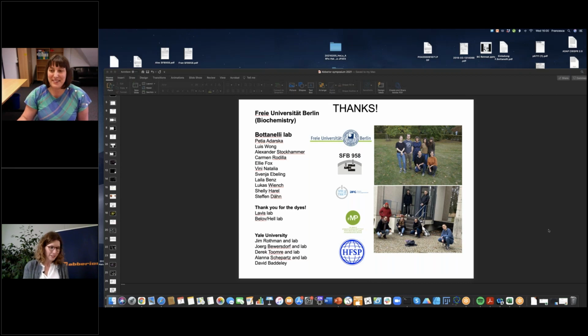Thank you. I want to add something to the previous question about snap and halo. I think halo has much faster kinetics. We actually made a side-by-side comparison, the same CRISPR knock-in background with snap and with halo, and it's very obvious that the halo is much better in terms of faster kinetics and labeling. We get about 10 times stronger labeling with the halo.